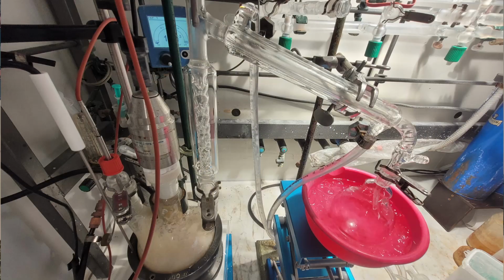And then Thursday we spent the rest of the day just distilling it, which took almost 2 hours, even though we used only a small Vigreux column. But yeah, that's basically it. There wasn't really anything else.